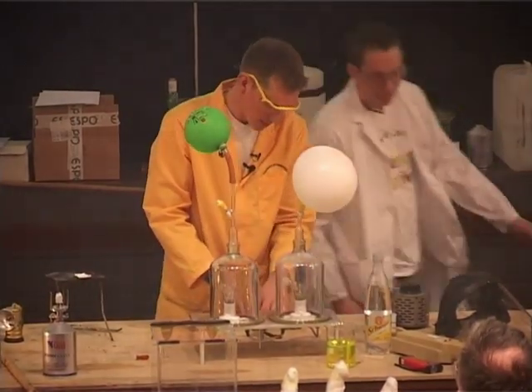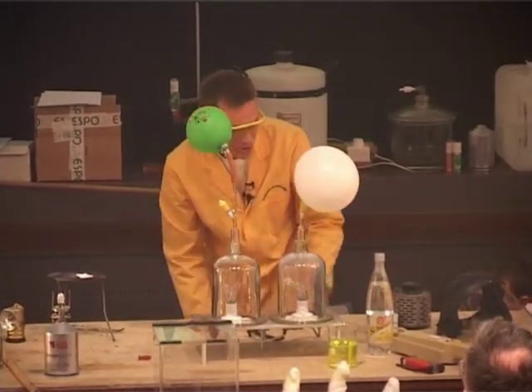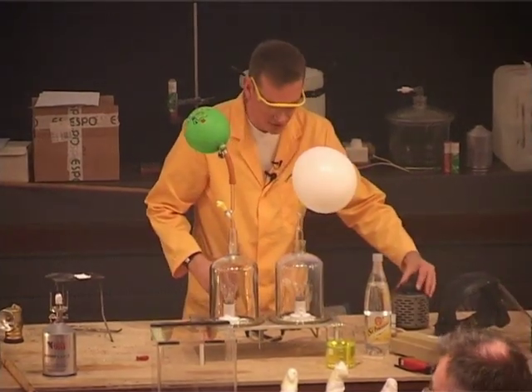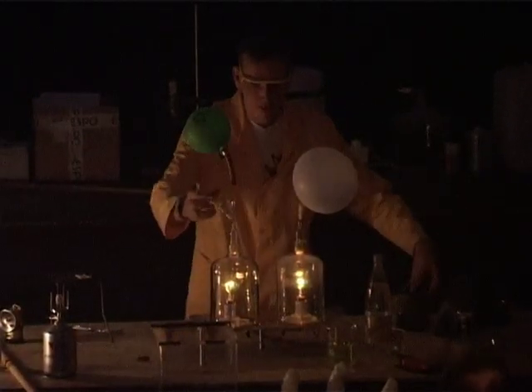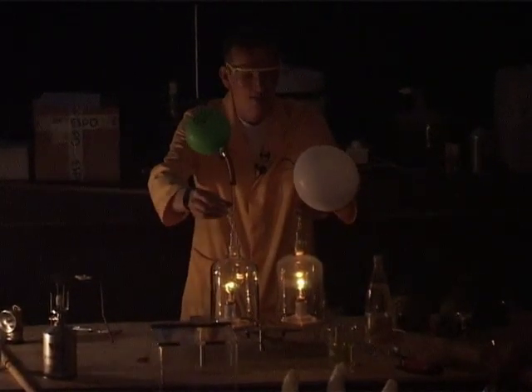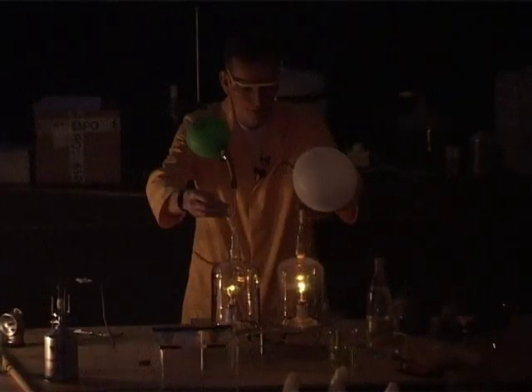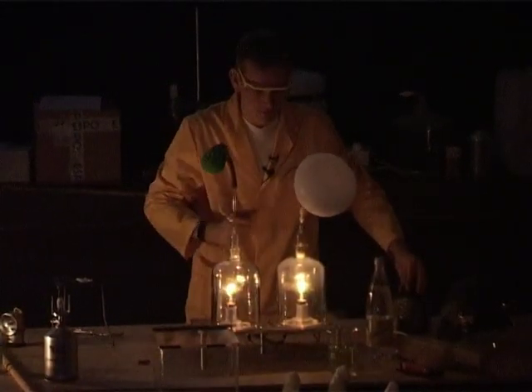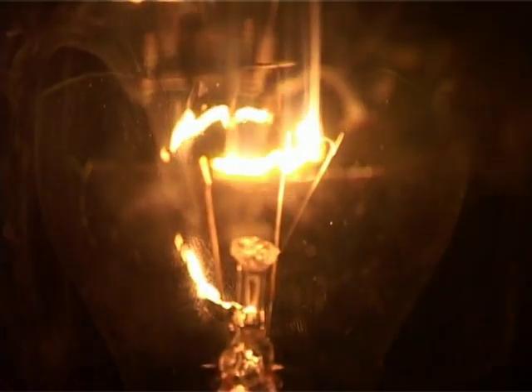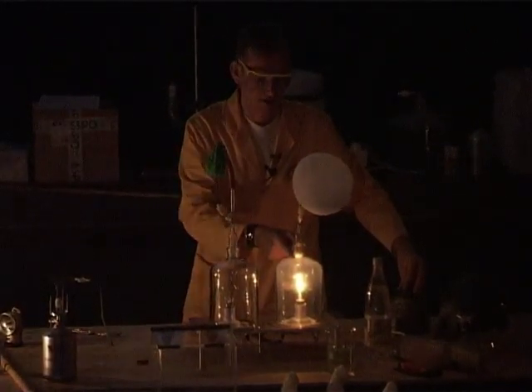Okay, and now, please. And now I'm going to switch on the light bulbs and just gradually turn them up. If we can have the lights down. And into the one with the green balloon, I'm going to let some air, and into the one with the white balloon, I'm going to let a gas called argon. Now let's see what happens. So the gases are going in. Let's turn up the voltage. And the one with the air has gone. It's blown. But the one with the argon is still alight.